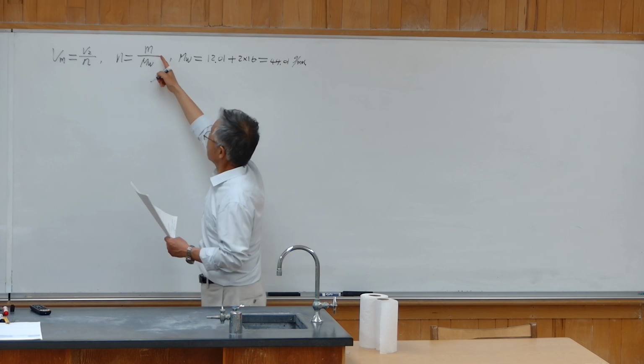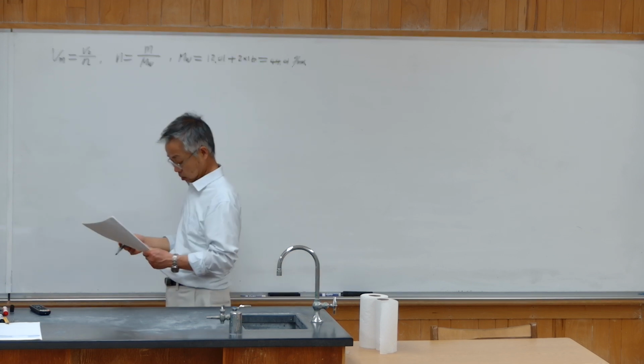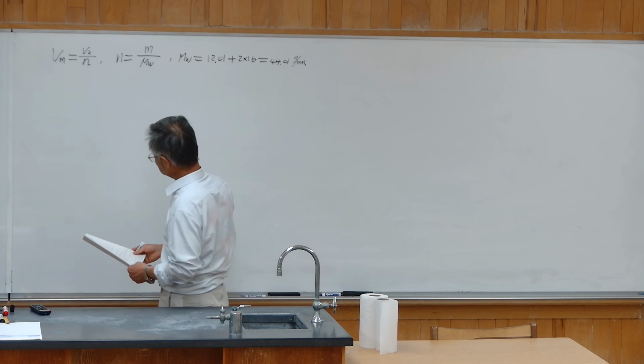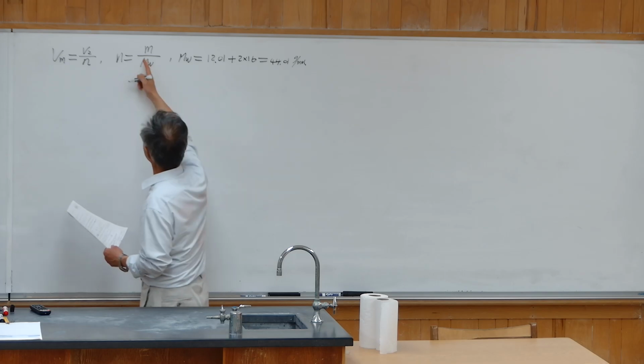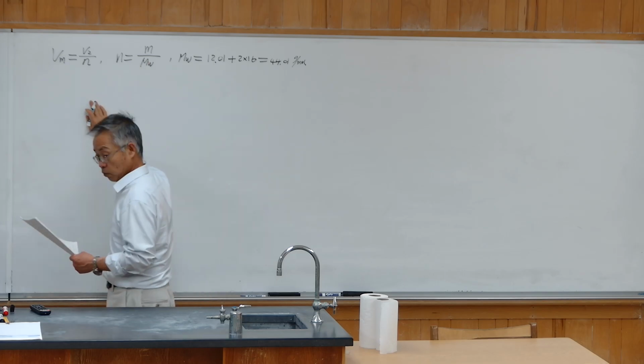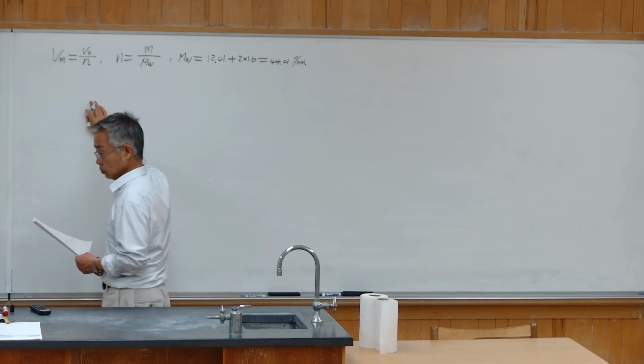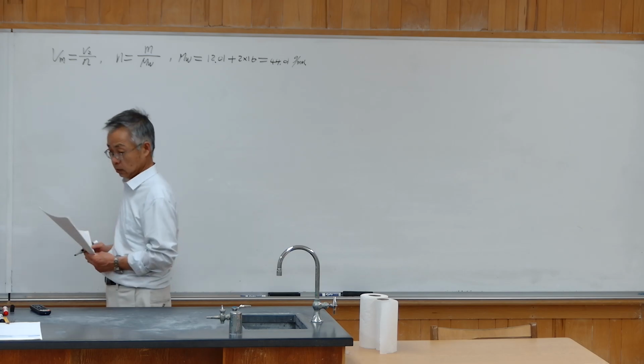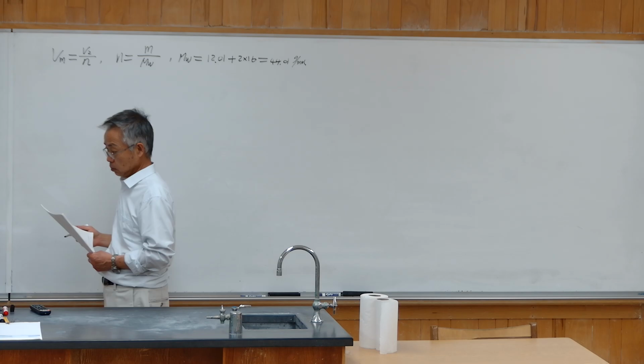And the mass, you need to watch the class video on how to calculate M from the experiment: determined mass of flask plus mass of cork plus air in the flask.